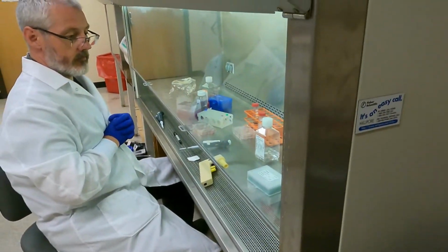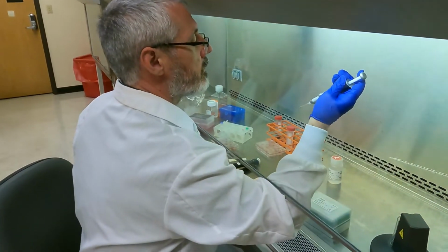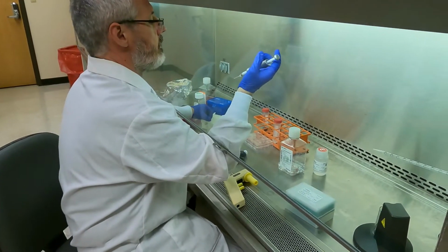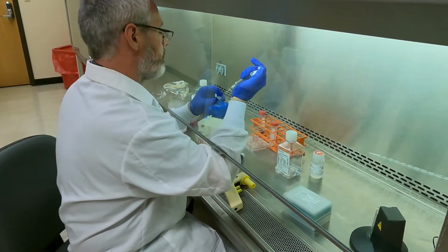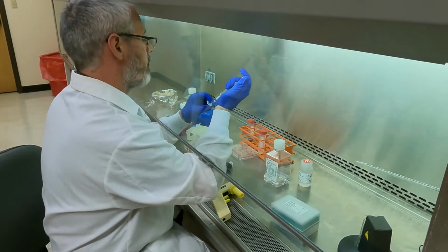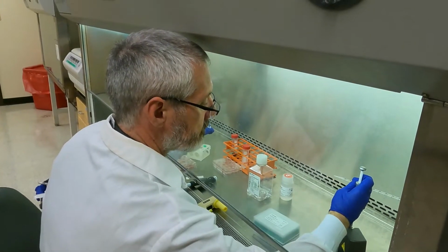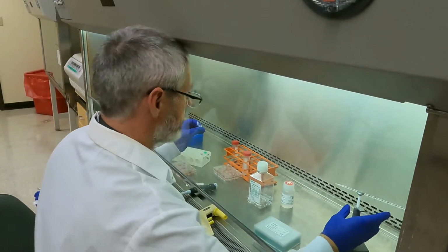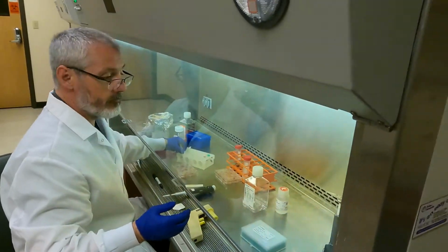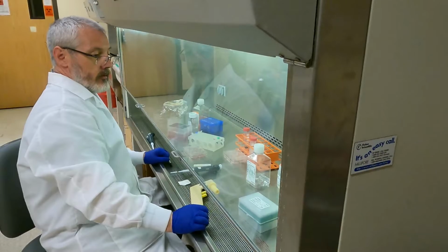Tip connection error. Okay. Sorry. Let's just try again. Oh yeah. See, there's a bubble. Yeah, I've got it now. There was airspace in there. Okay, fire again.